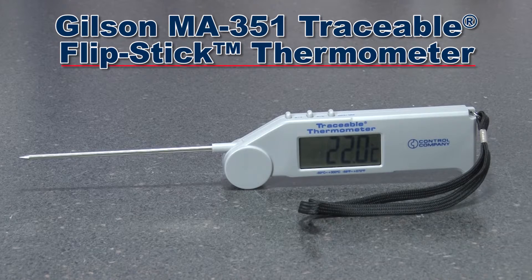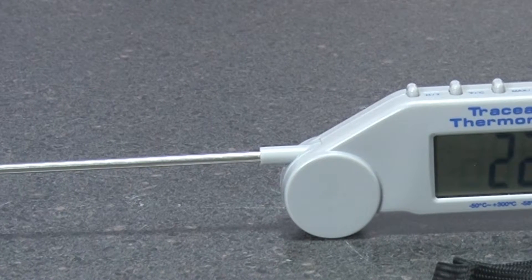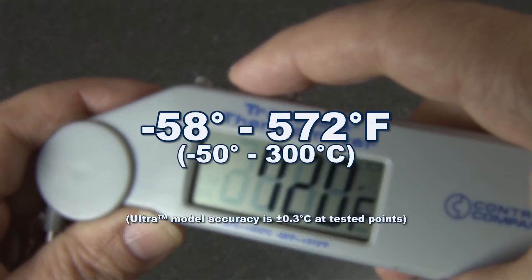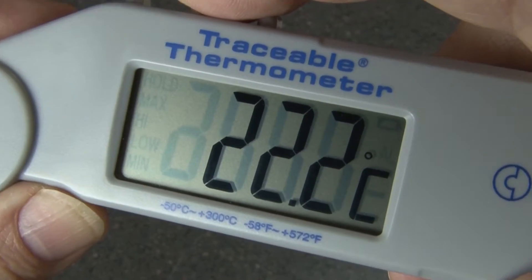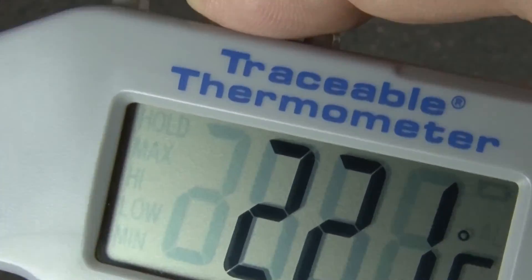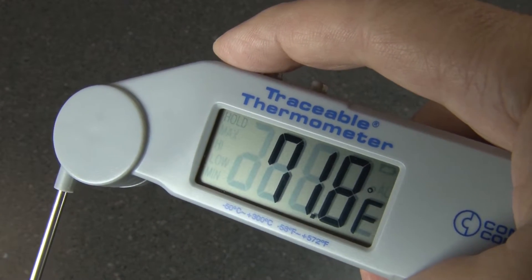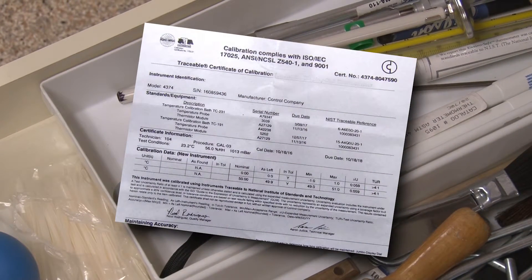The Gilson MA351 traceable flip stick thermometer has a flip-to-open design and a stainless steel probe that can be positioned at any angle. The MA351 has a temperature range of minus 58 to 572 degrees Fahrenheit, shown on a large LCD display. This rugged thermometer features a Fahrenheit to Celsius switch, a maximum minimum temperature recall, and a temperature hold switch. Each unit is serial numbered and includes an NIST traceable certificate.